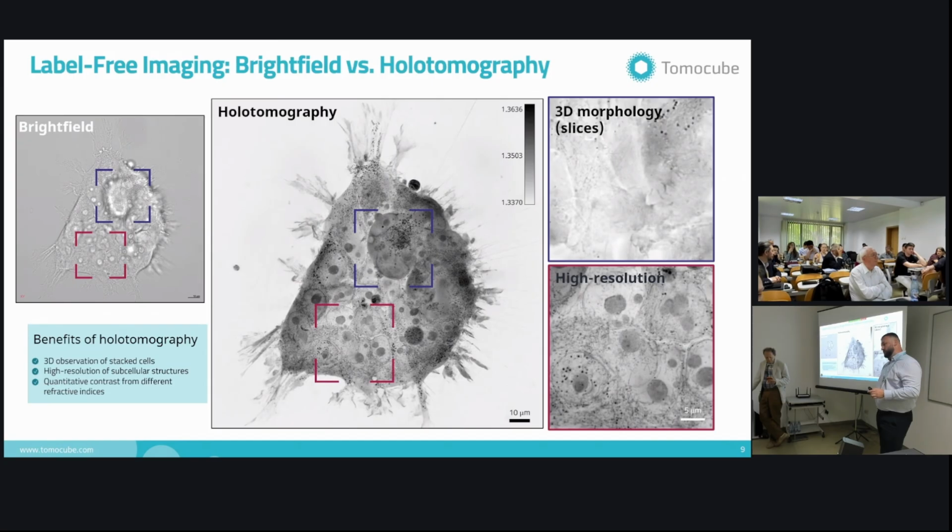And the second short one: how much time does it take for, let's say, a time-lapse microscopy overnight file to be reconstructed? So for the image analysis. Depends. You mean after acquisition? After acquisition, how long does it take to generate the 3D visual? So you mean the processing itself. That would be the deconvolution. Let's call it deconvolution. Yeah.